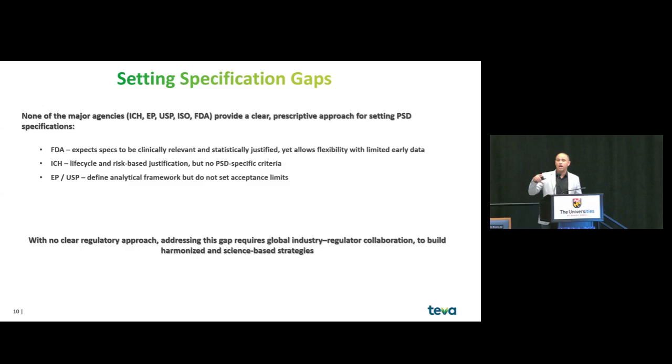So we have 3 sites that have basically the same method. It's not usually the same method, but a similar method, testing the same material, and we usually see different results, but we need to sit within the same specification. And as I said, 3 samples, this is what we have, at least in the beginning.